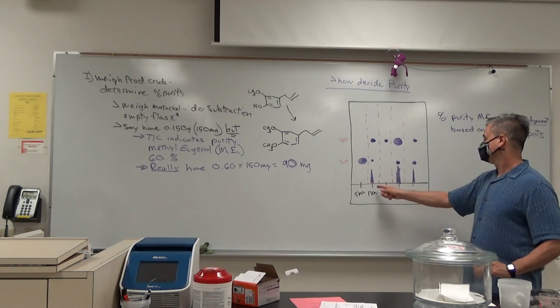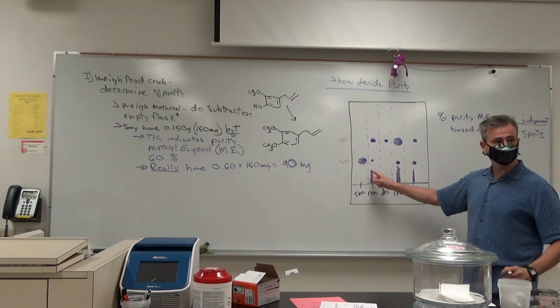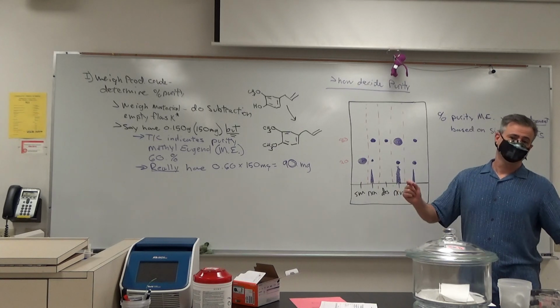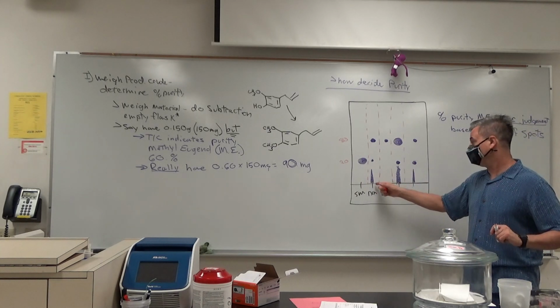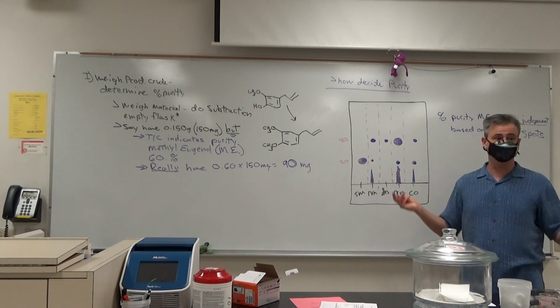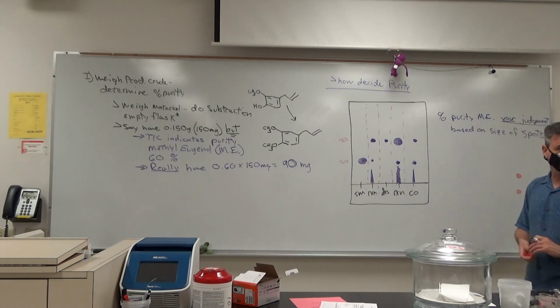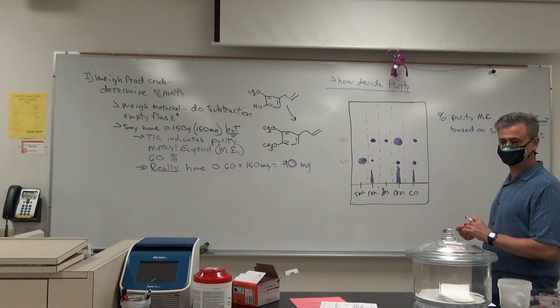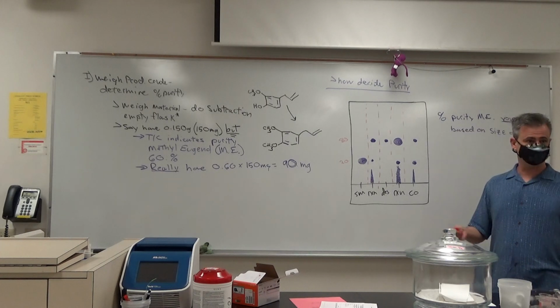But a lot of the time we get a streak here. You guys got to use brand new Eugenol. Congratulations. I'm hoping that maybe you don't have a big streak here, but in the past we normally have a big streak here. Side products, we don't know what they are. Made some other junk. You cooked it pretty good, 135 degrees or whatever for an hour to 2 hours.